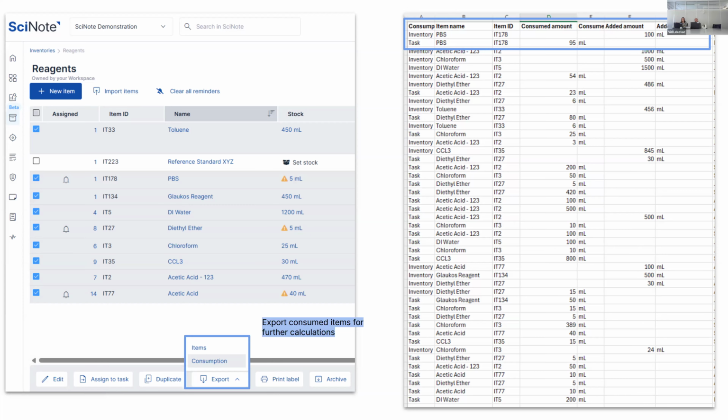They say, we're actually going to let that team use something else. But no, at the end of the day, it's important that you centralize your inventories. And I'm sure Blaszka would have more ideas and comments here, because I talk about features, but she's the one that's actually doing the change management and talking with the customers.